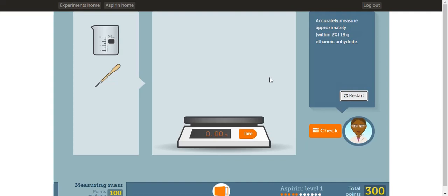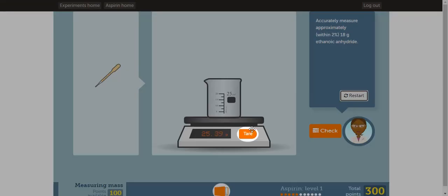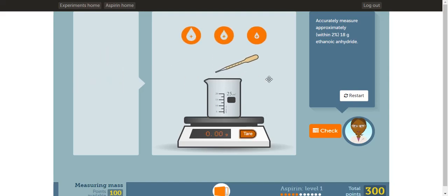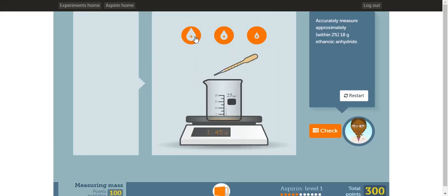Note, you do not need the exact amount as long as within 2% error. Once you have 5 grams of the substance, you can click check. In the next part of the experiment, you have to measure about 18 grams of the other reactant. Place the beaker on the scale, then click tare. If the scale does not reach 0 grams, click tare again. Next, drag the dropper next to the beaker. You do not need the exact amount as long as within 2% error. Click these top buttons until you add about 18 grams of the reactant.